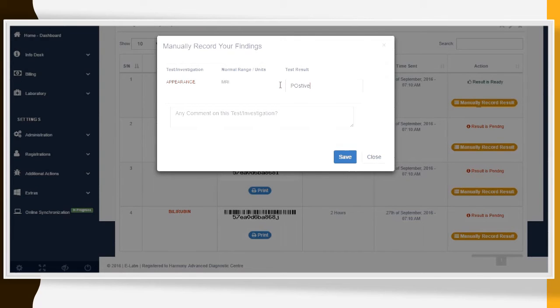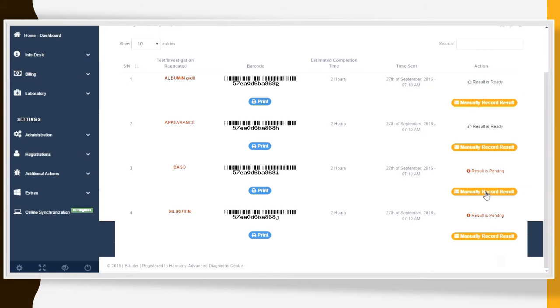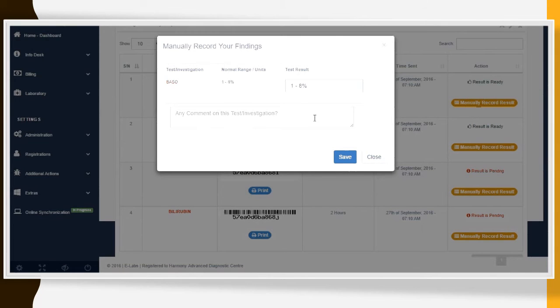I'm just going to put positive here. Oh, sorry, it doesn't. Okay, I'm just going to put positive here, and I'm just going to put 9% here. So this is way high. So there's something wrong. This is just my own comment.